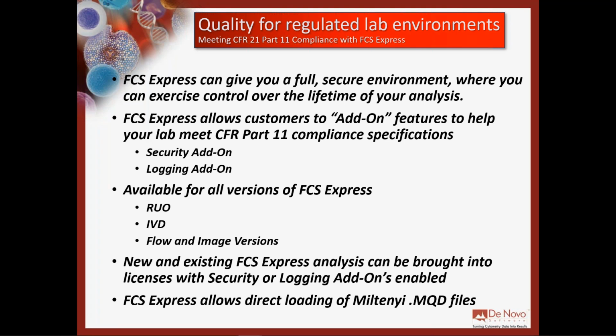The other really important thing here today is that FCS Express allows direct loading of the Miltenyi .mqd files. So at acquisition, they're going to be stored as .mqd files. Of course, those can be translated into an FCS file for use in any third-party software.